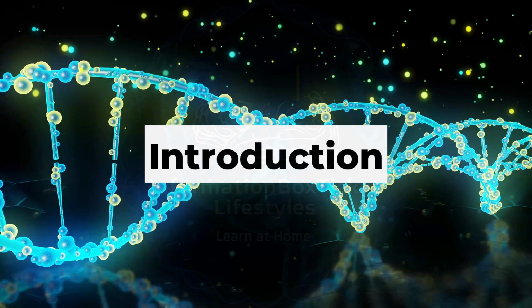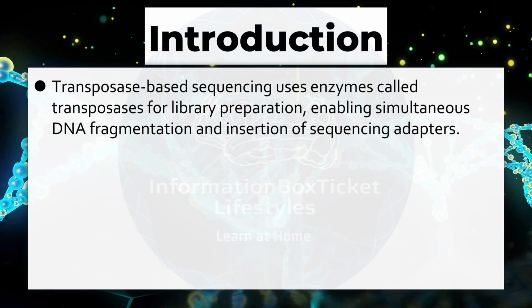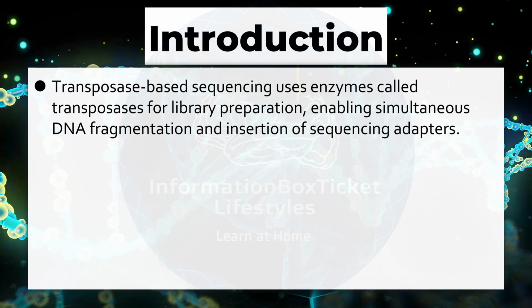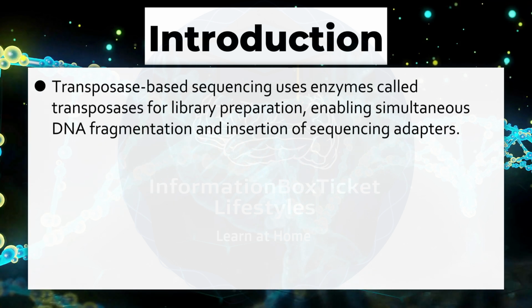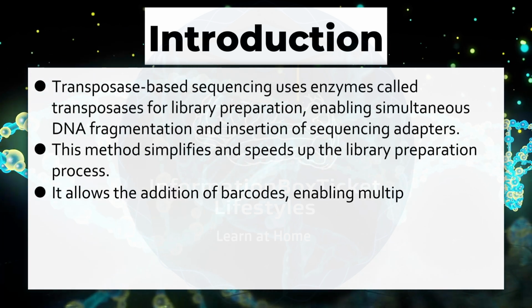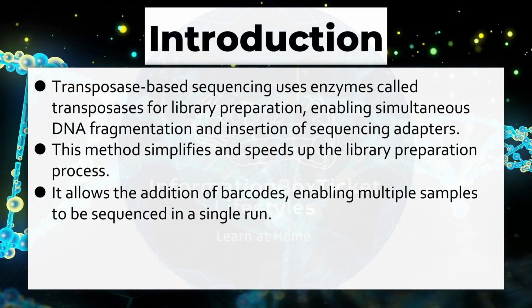Introduction to transposase-based sequencing. Transposase-based sequencing uses enzymes called transposases for library preparation, enabling simultaneous DNA fragmentation and insertion of sequencing adapters. This method simplifies and speeds up the library preparation process. It allows the addition of barcodes, enabling multiple samples to be sequenced in a single run.